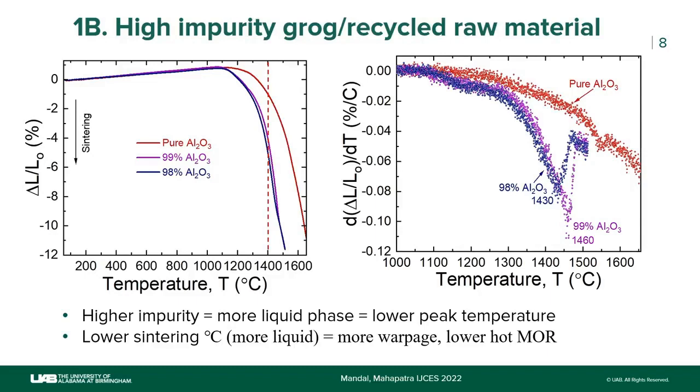So the test itself is very repeatable. But if your bag of raw material itself is not consistent, that's what this test is telling you. This is a screening technique, so you can rely on the test, and it gives you a measure of the inconsistency of the quality of the raw material. Yes, it is repeatable.